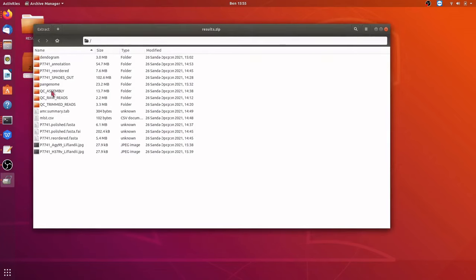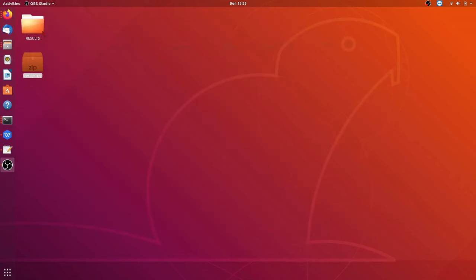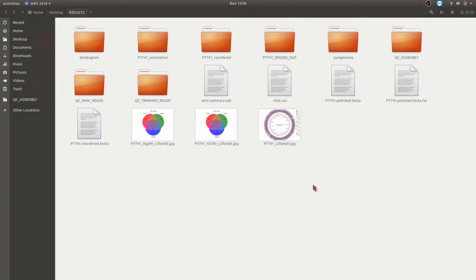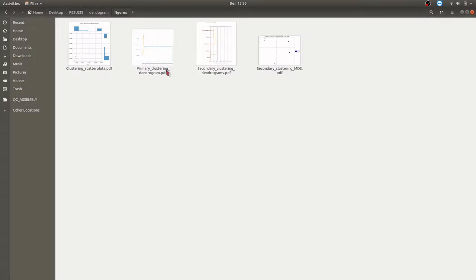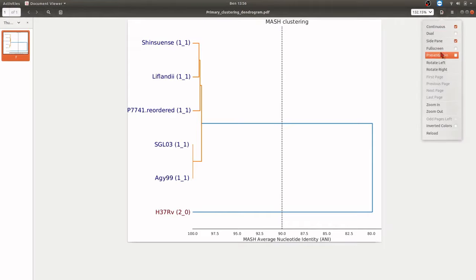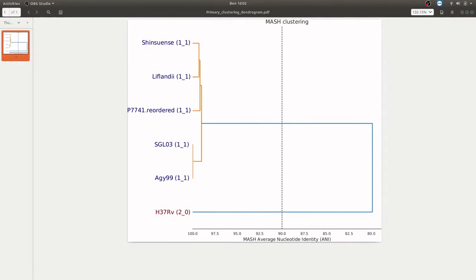I have my results extracted here, and that's what we are going to look at. The first one we'll look at is the dendrogram. We are interested in this particular one. Let's look at the clustering — we have primary and then secondary clustering.